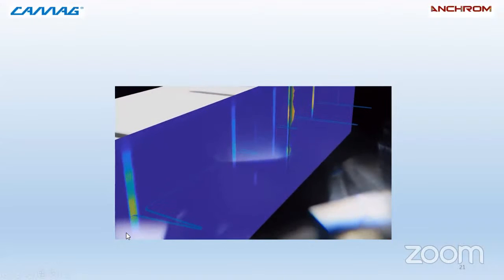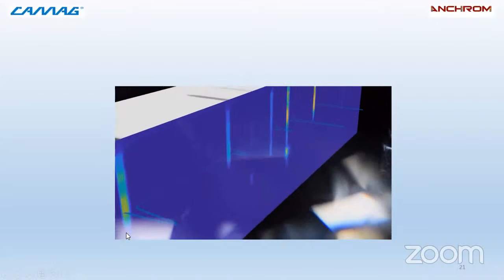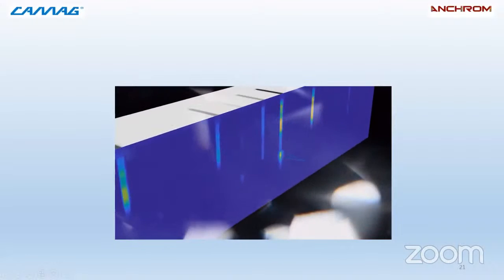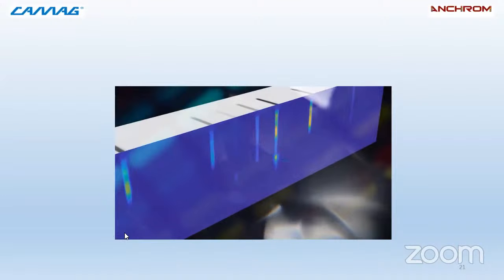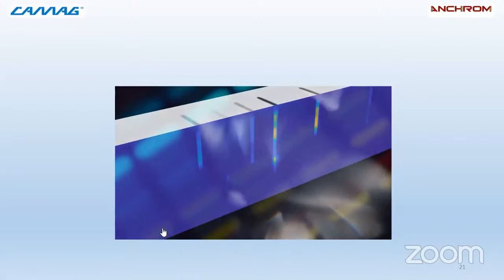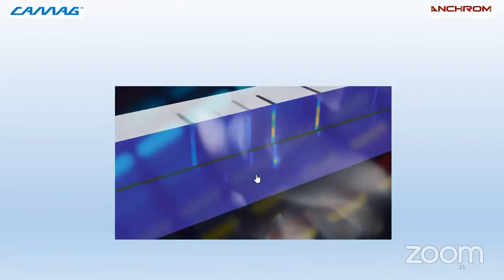Although these, you can see those blue color, and the focus of the system is on automation, high throughput, and reproducibility. We'll see how it works. We have two videos in our lab: sample applicator and development module.